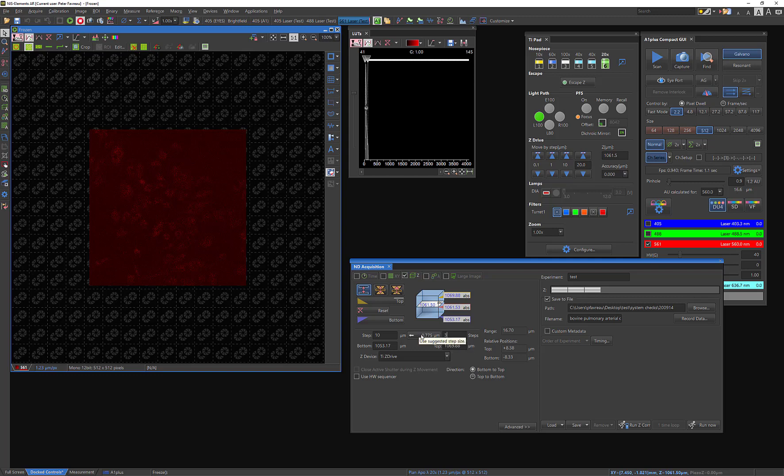This is a suggested step size. And this is suggested based on Nyquist sampling. I'm not going to go into Nyquist sampling here. But suffice it to say, this is essentially the smallest step size you can do before you start oversampling. So if I were to try to do like 0.6 or something, that would be so small that I would get diminishing returns on my imaging where it wouldn't matter.